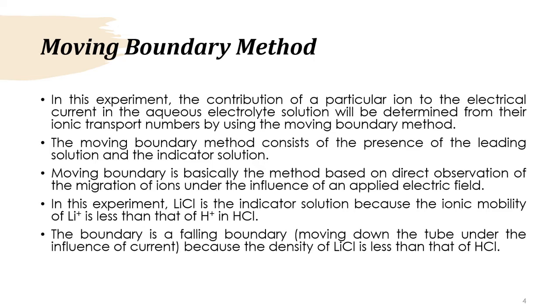So in this experiment, the contribution of a particular ion to the electrical current in the aqueous electrolyte solution will be determined from the ionic transport numbers by using the moving boundary method. There is another method which I want you to also find out, which can also measure the transport number, but is not as good or as accurate as this moving boundary method.